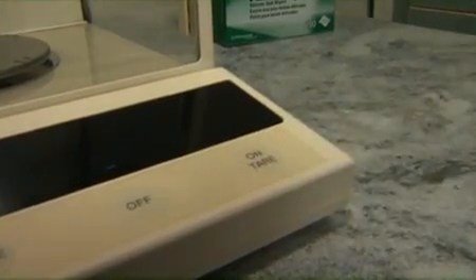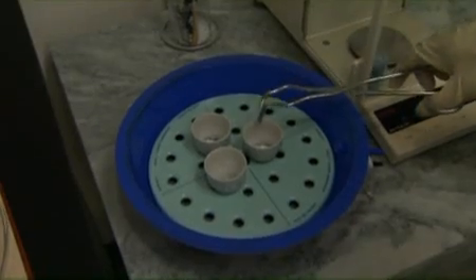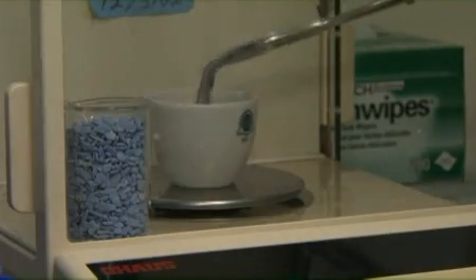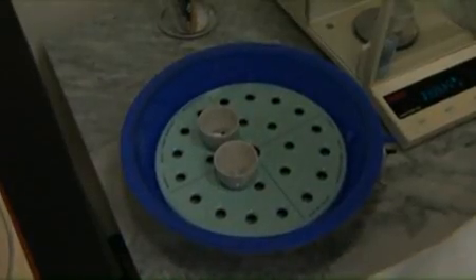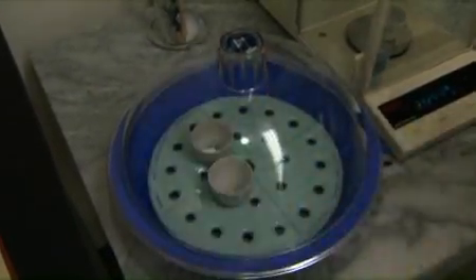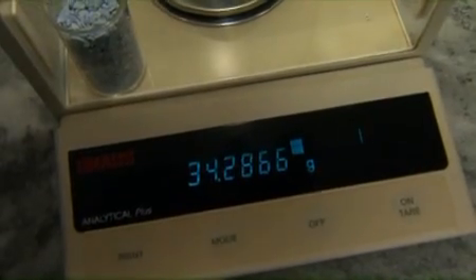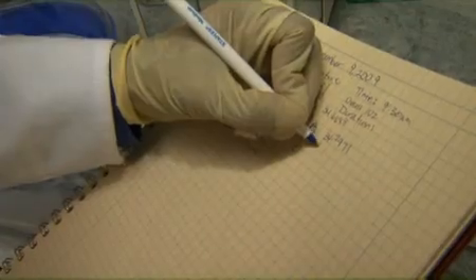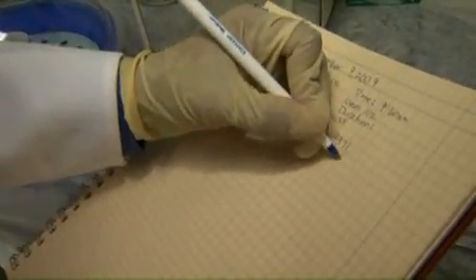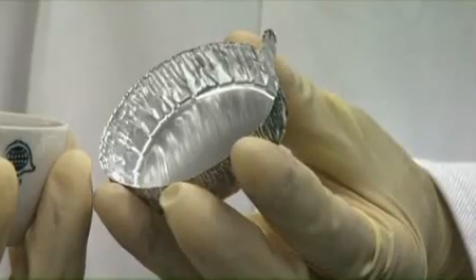Tare the analytical balance. Using tongs, remove one sample container from the desiccator and place it on the balance. Immediately replace the desiccator lid. Record the drying container ID and the weight of the dried sample and container. Continue the process until every dry container has been weighed and recorded. If aluminum pans were used, they can be discarded.